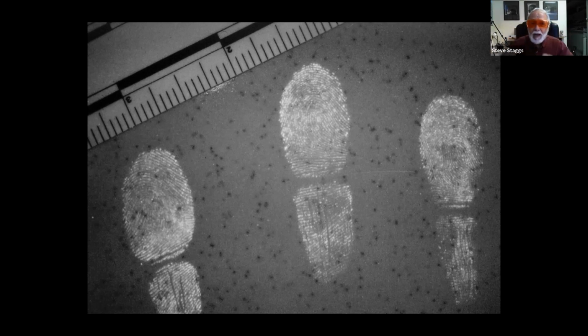So for my blue light, what I'm going to need to do is wear these goggles, right? For my lens, I'm just going to have to put an orange barrier filter, or you could have a screw-on orange filter. So here's an orange filter. I can just put that over my lens. And then here is the result.